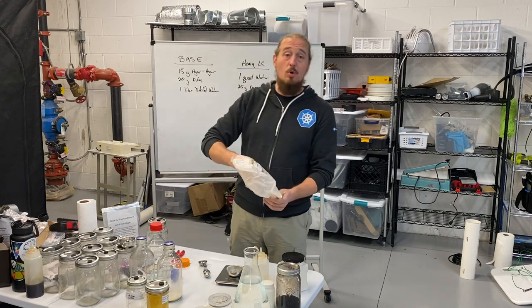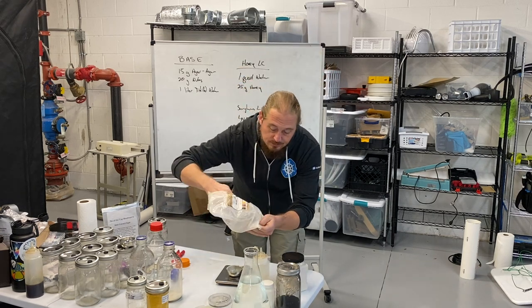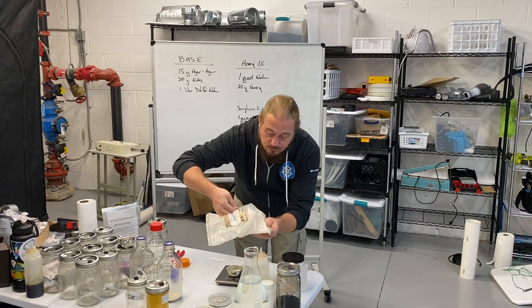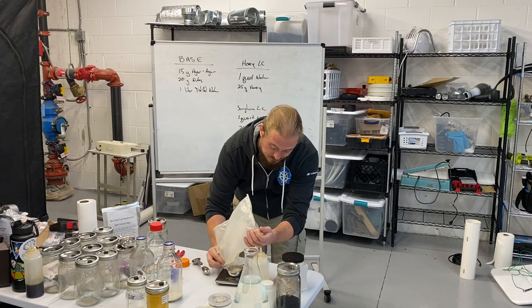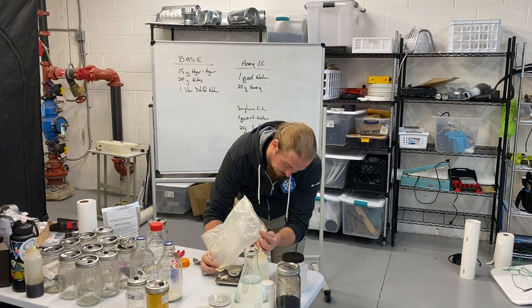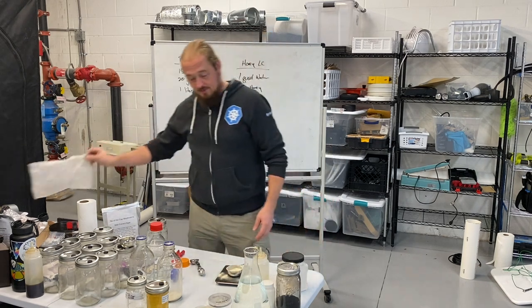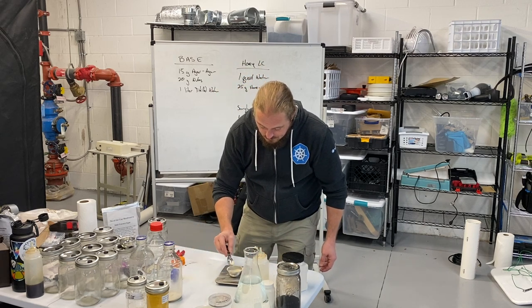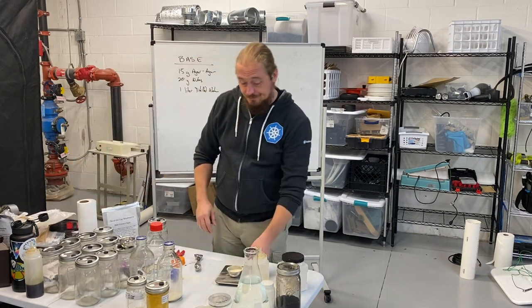This is malt extract powder. I'm going to get 20 grams of this weighed out. A little bit of a mess, but I'll finish that off. 20 grams. I think that bag of malt extract is dead.